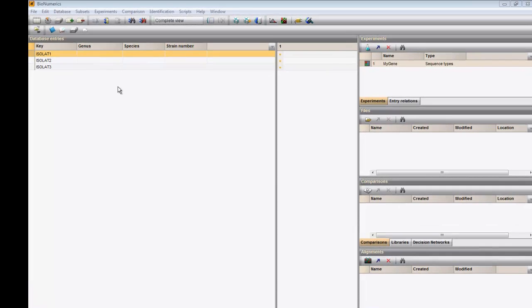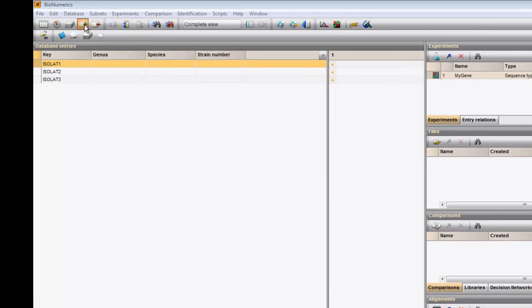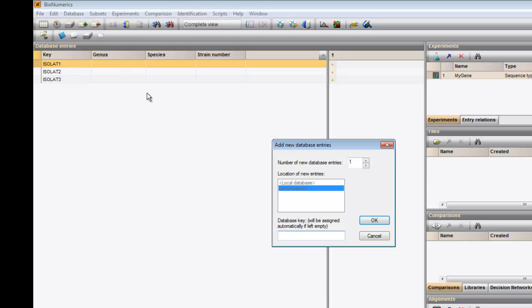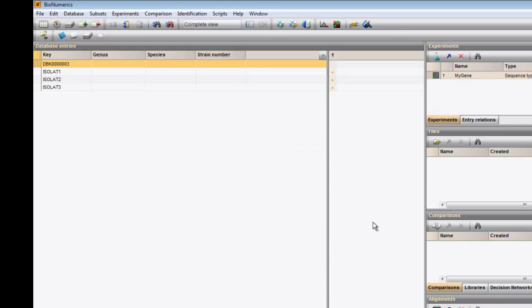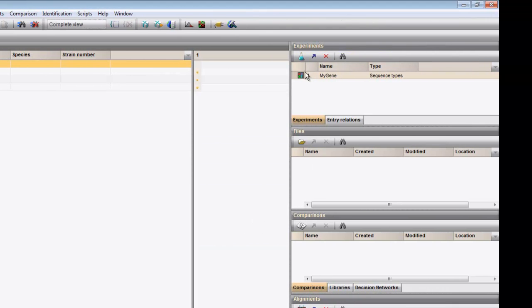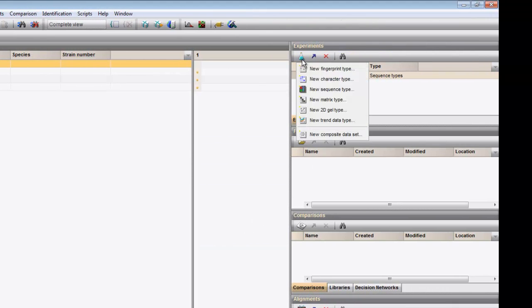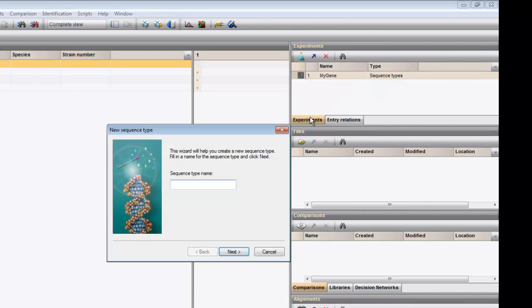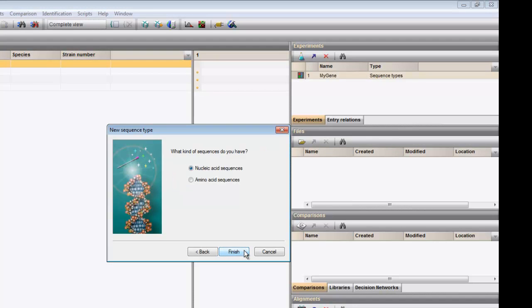I start by adding a new entry to my database, to which the assembly project will be linked. And I create a new sequence experiment type for nucleic acid sequences.